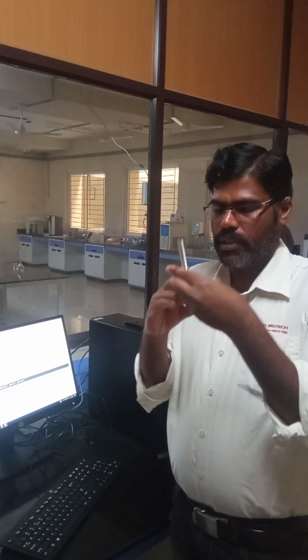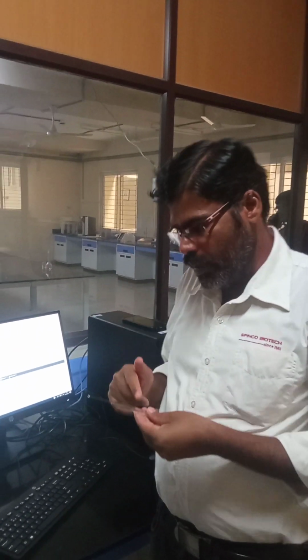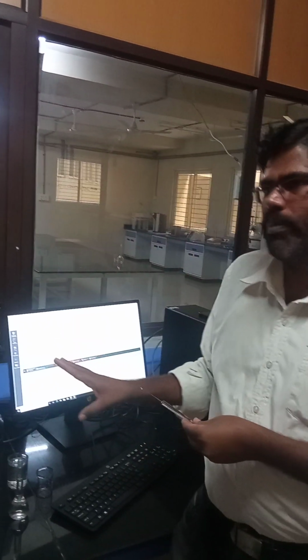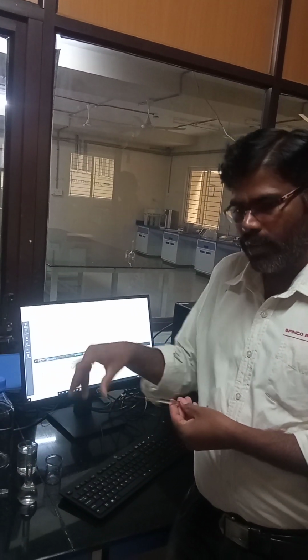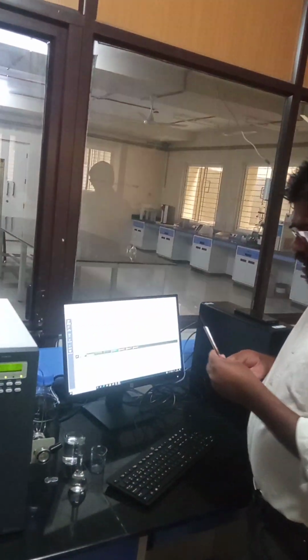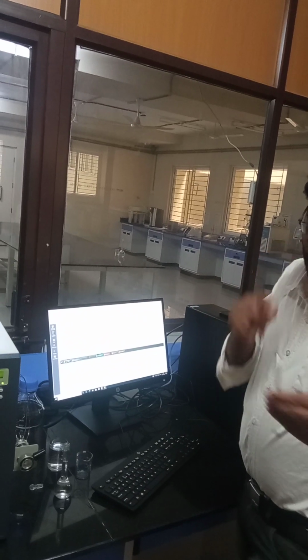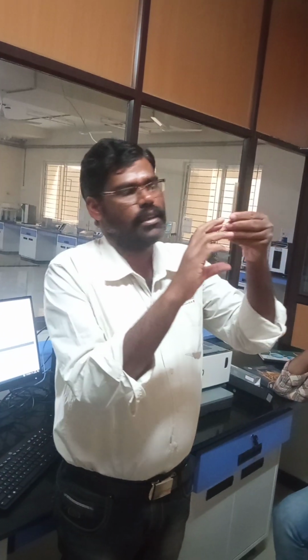Now, the syringe capacity is up to 25 microliter. However much I inject, the loop capacity is only 20 microliter, so it will take only that. In case you take 50 microliter and inject, it will inject only 20 microliter. I am just taking roughly. If you want to inject less than 20, you have to measure accurately in the syringe itself. That is also a good question: if I want to inject only 10 or 5 microliter, you have to measure approximately like this.